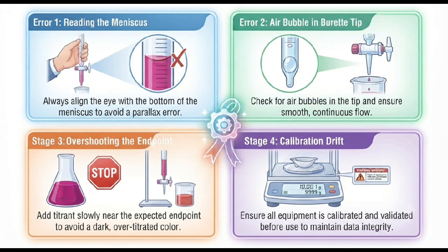Common errors. Common errors include incorrect burette reading, air bubbles in the burette, improper rinsing, contamination of solution, incorrect indicator selection, adding titrant too quickly near the endpoint, and incomplete dissolution of the sample.